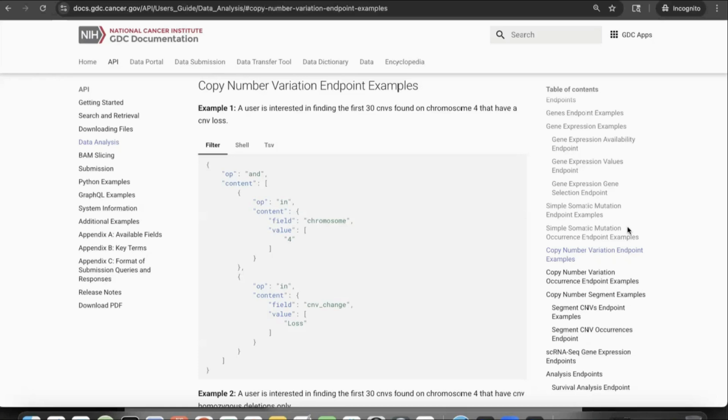What I will say is that you will need to look at the segments rather than the gene level copy number, because the gene level is based on the gene model. Is that correct, Anya? Yes, the integer value segments were the actual input of the gene level. We simply overlap the gene range to the segment range, and the genes inherit the copy number from the segment. If you are looking for a location that does not belong to a range of a gene defined by the gene model, then the segment file is what you should look for. Thanks, Anya.